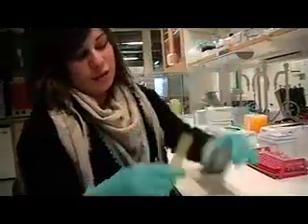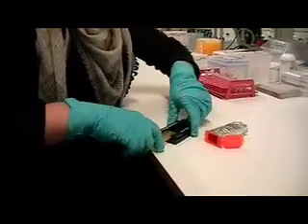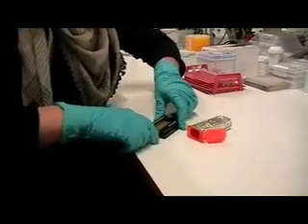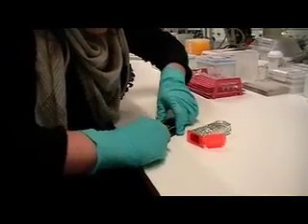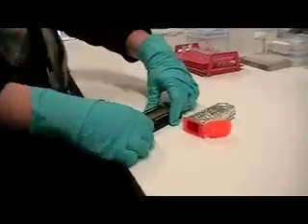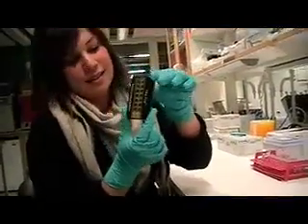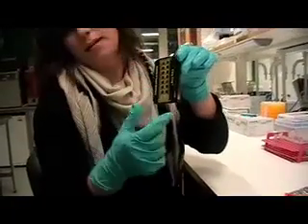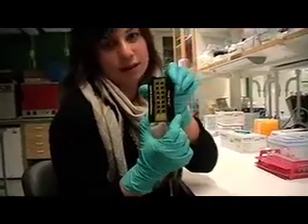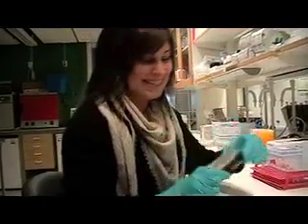You just put the mask and the slide on the holder. So you have now 14 wells, and you can put whatever antibody you want into these wells and test the presence of some proteins.